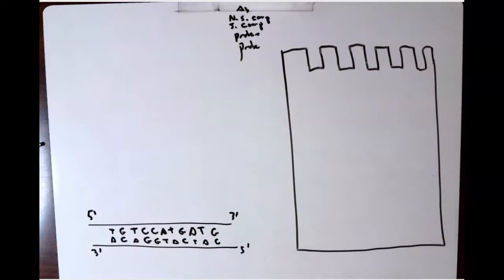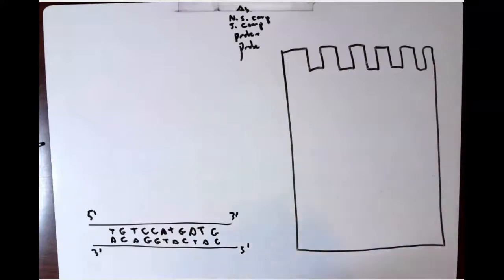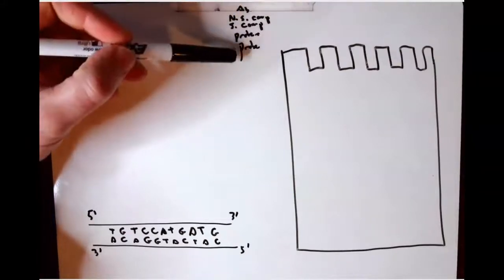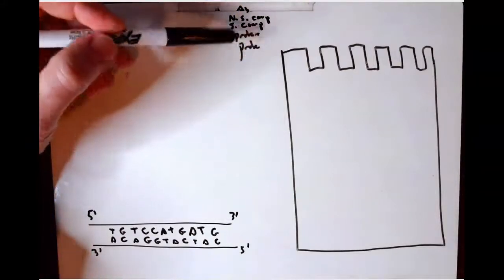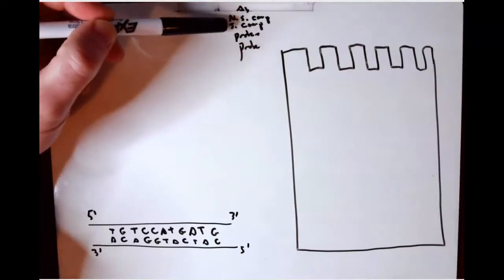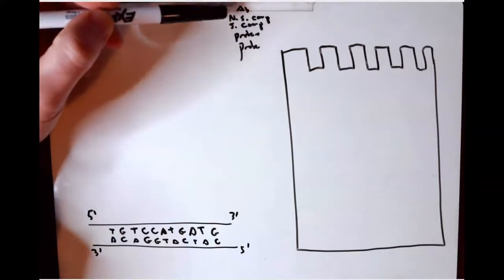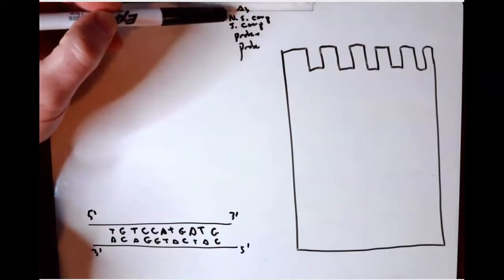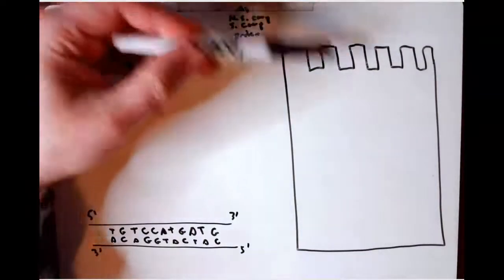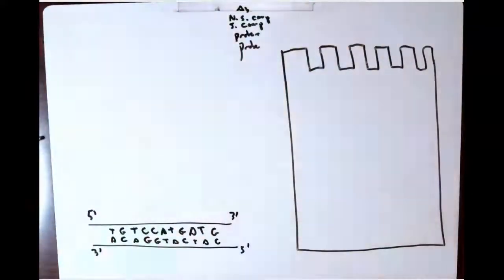So what I have here on the board so far to orient you is a gel, of course, with 5 wells in it, and then different things that we can add to each reaction mix. In case you can't really read my handwriting here, what we have is the probe, we have the protein that we're studying, we have S-comp, which is the specific competitor, which is unlabeled, NS-comp, the non-specific competitor, which will be unlabeled, and the antibody. And by saying which ones of these we add to each of these lanes, we'll get a better sense of how the gel shift works.